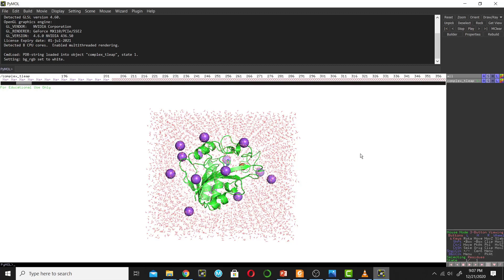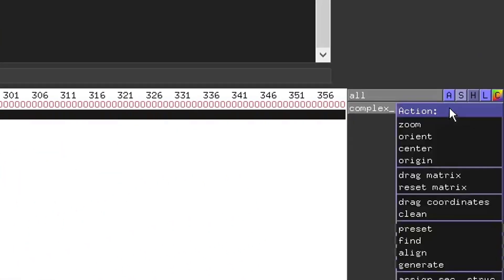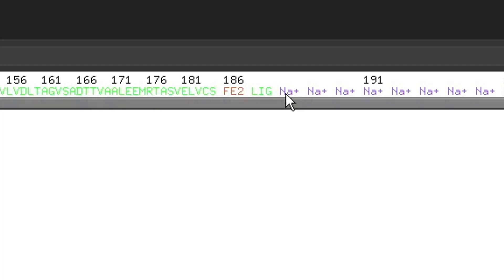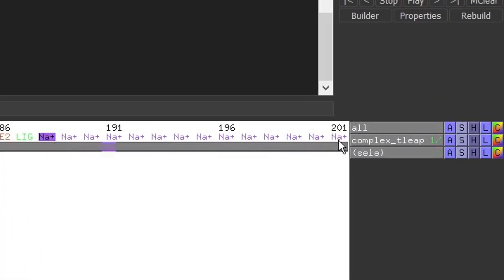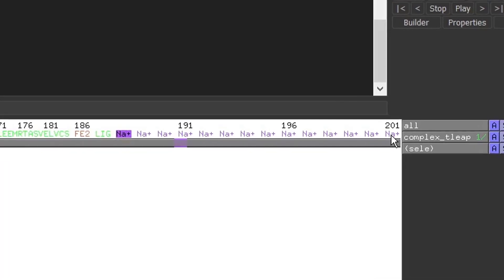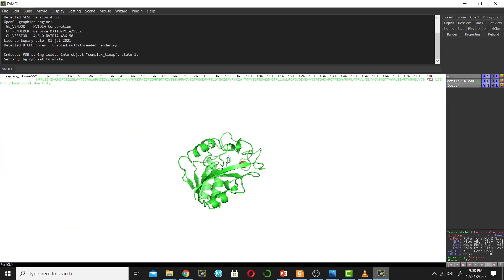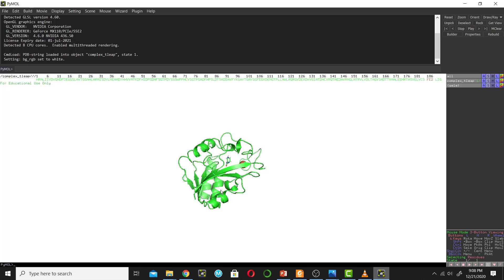Now I will remove the water molecules. Go next to the complex, click the Action button, go down, and click Remove Water. Water is now removed. To remove the sodium ions, click on the first sodium ion, then shift-click the last sodium ion to select all of them. Then right-click on any sodium ion and click Remove.